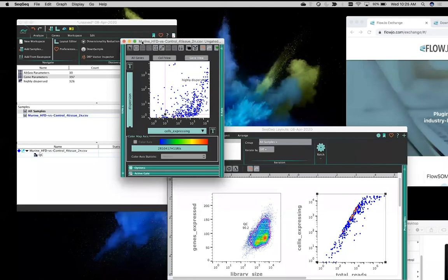The thing, though, is that within that, you're going to want to perform a really heavy QC. Even if you have 30,000 parameters, you still want to drill down to those most highly dispersed set. And whatever that highly dispersed set is, you want it to clearly identify at most maybe 20 or 30 subpopulations in a first pass through the analysis. You may find hundreds of subpopulations as you dig into a very heterogeneous sample, but you're going to have to drill down into distinct subpopulations typically. You don't want to get 100 populations the first time you go through your analysis.